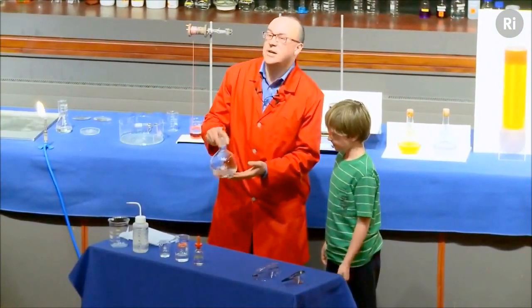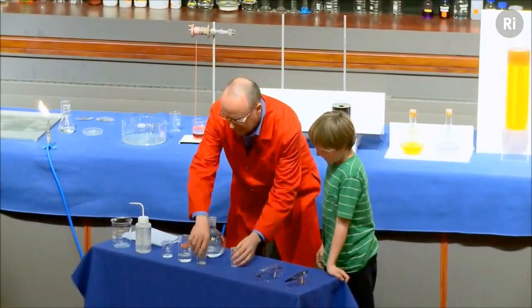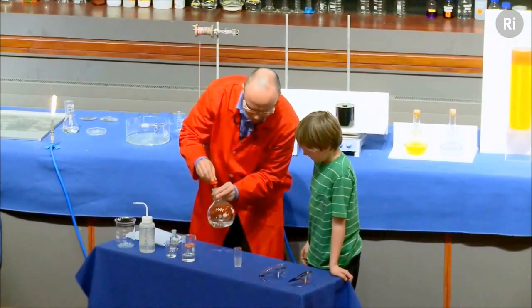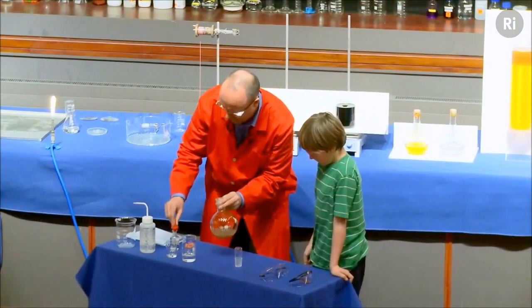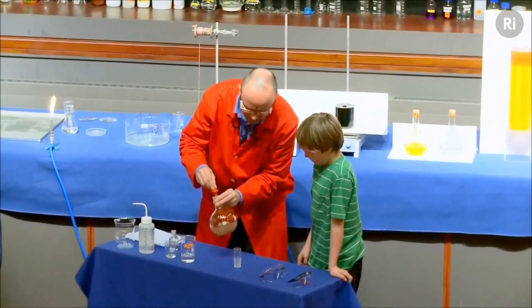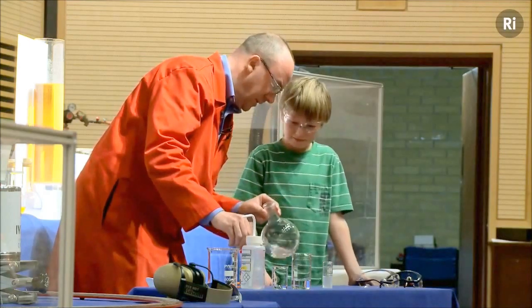I'm going to start off with a flask that contains a solution of silver nitrate, and I'm going to add a little bit of ammonia. Now, when I add the ammonia, you see that it's forming a sort of brown colour. I'm going to keep on adding the ammonia, and that brown colour should disappear.